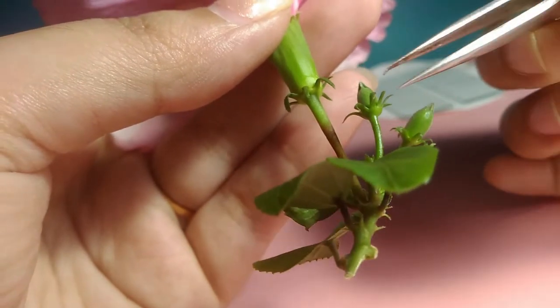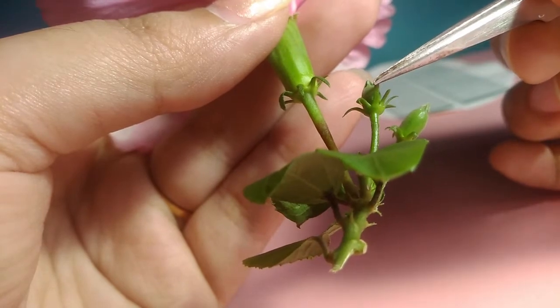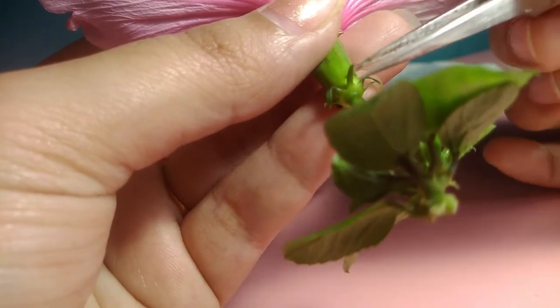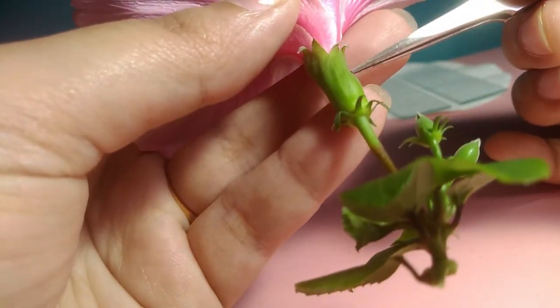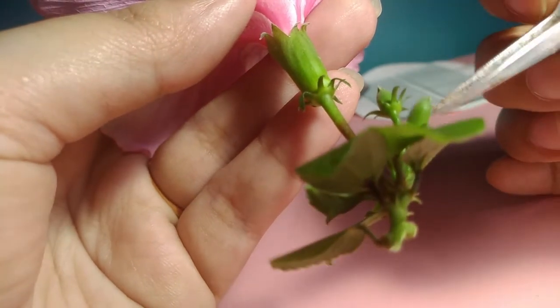Okay, and what is this thing below the calyx? These things, pointed things, these are called epicalyx. Here also in the flower we can see that the epicalyx are present. Okay, so we learned about calyx, and then we learned about epicalyx. And what is the function of calyx? The function of calyx is to protect the developing bud.